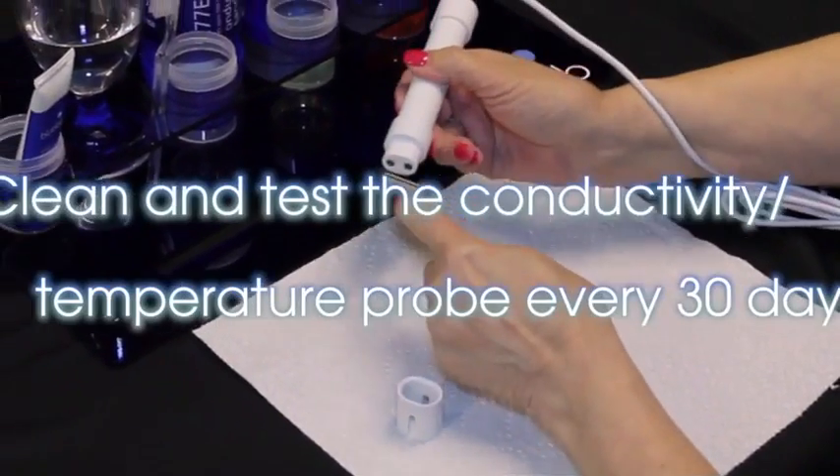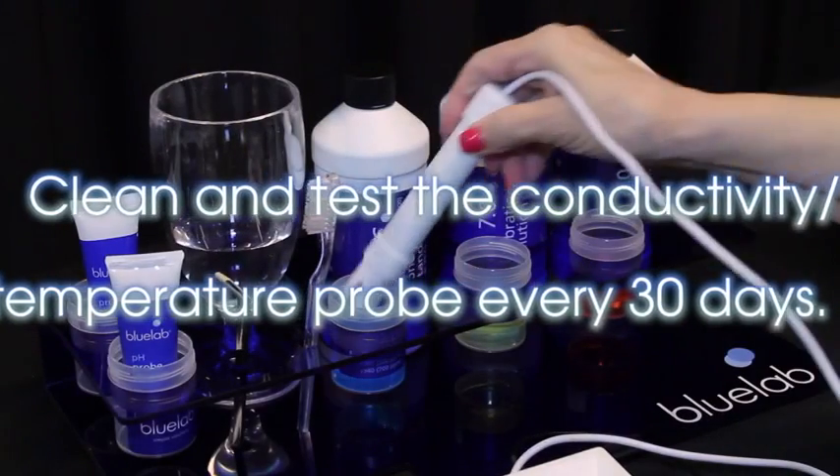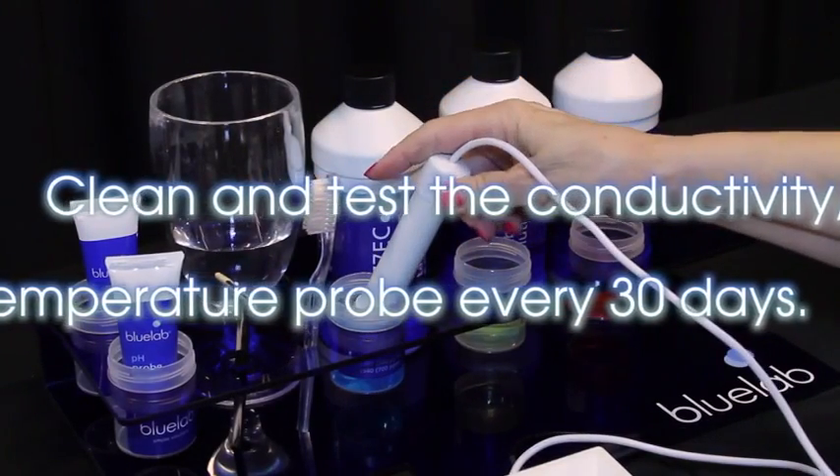Your conductivity temperature probe is factory calibrated so it's ready to use. You'll need to clean and test it each month to ensure accurate readings.